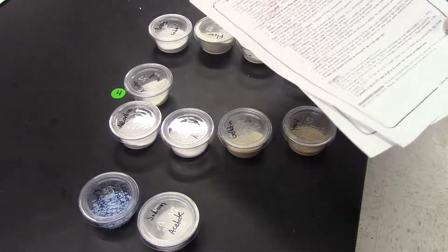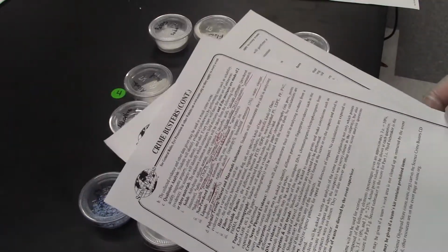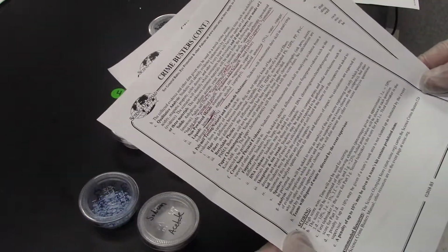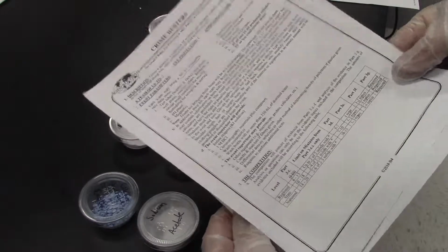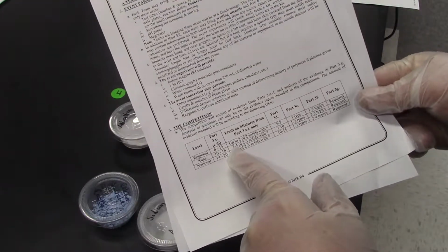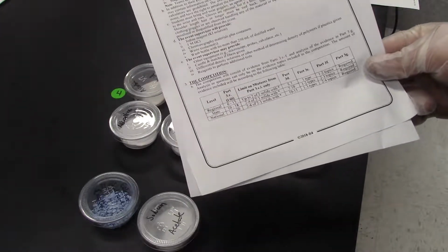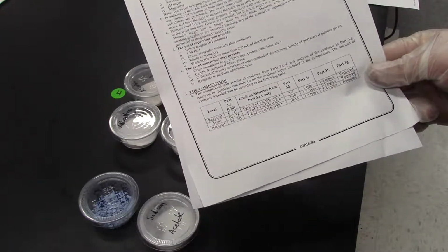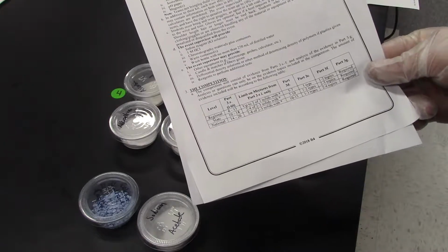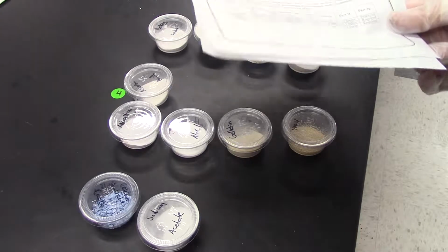You will need to be able to identify these powders, and there's a series of steps you're going to go through to figure this out. According to the rules at a regional competition, which would include our Patriot invite and also the UNK invite, you could have anywhere between 6 and 15 of these to identify. So you will want to practice these outside of the normal school day.